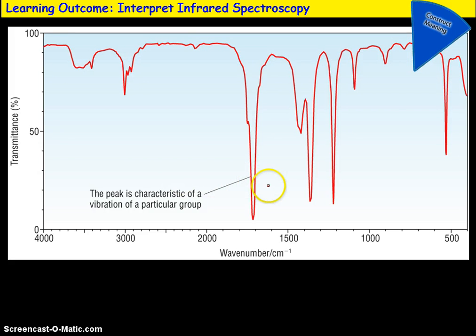So let's have a go at identifying some of the key peaks. For example, this is an example of a key peak that is characteristic of the functional group that is present. Anything that is below approximately 1,500, this is the fingerprint region. So each of these vibrations, for example, we know that a vibration at about 3,000 corresponds to a CH vibration.